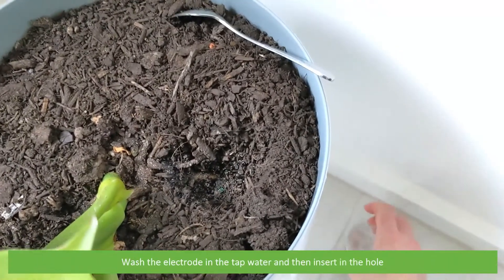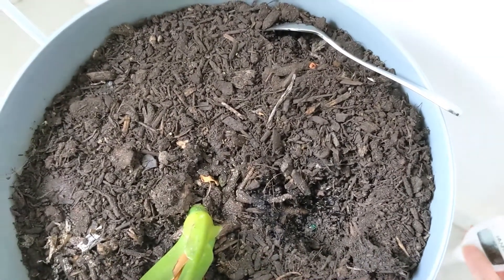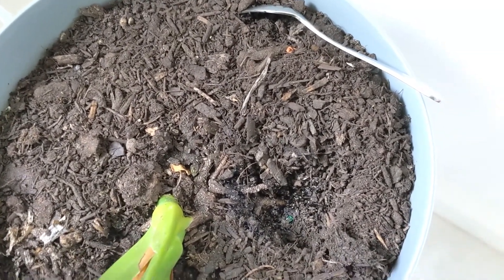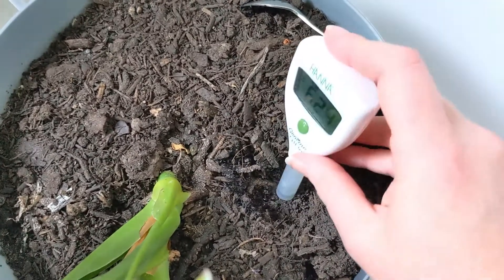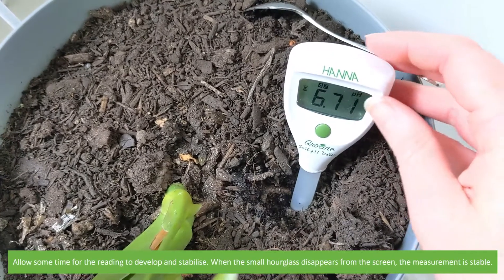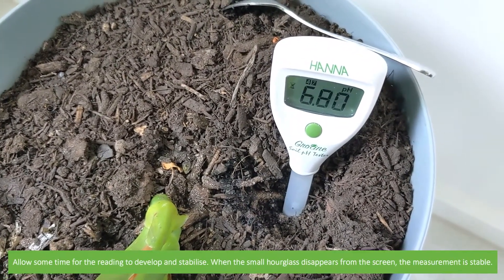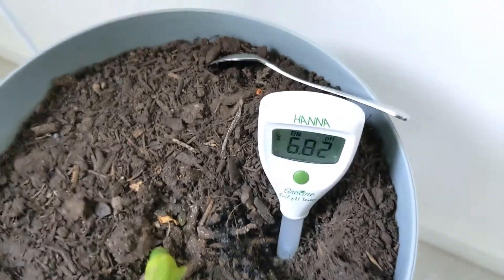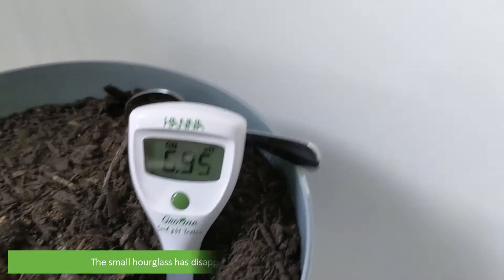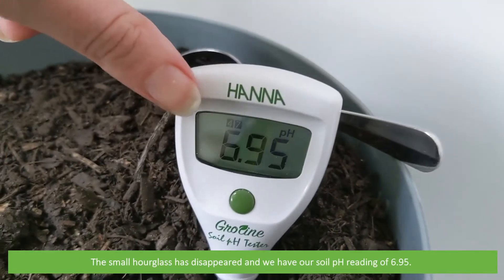Wash the electrode in the tap water then insert it into the hole. Allow some time for the reading to develop and stabilize. When the small hourglass disappears from the screen, the measurement is stable.